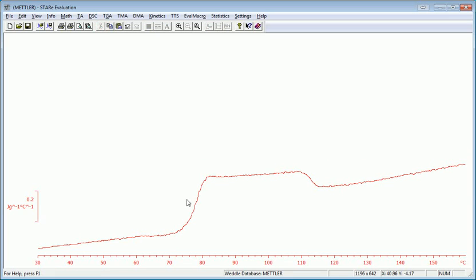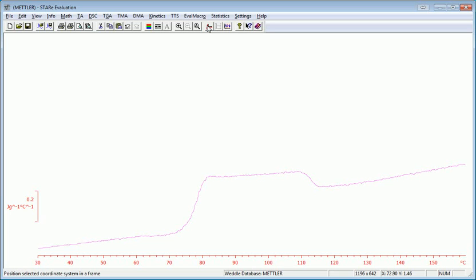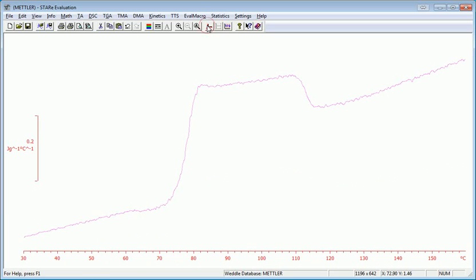Then I can bring this heat capacity curve full screen by selecting it and choosing coordinate position. That looks a little noisy. That's just because the smoothing settings that we had. So we can fix that a little bit later. Let's do something else.